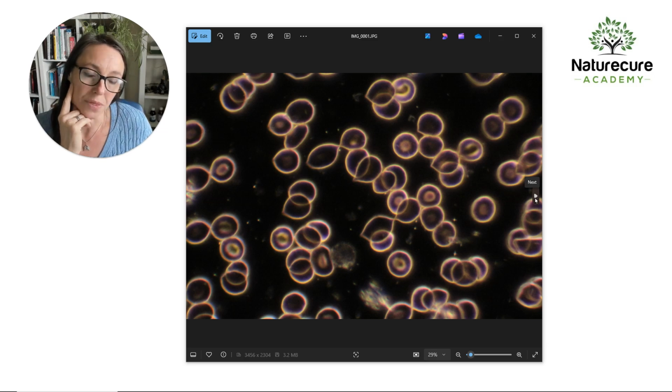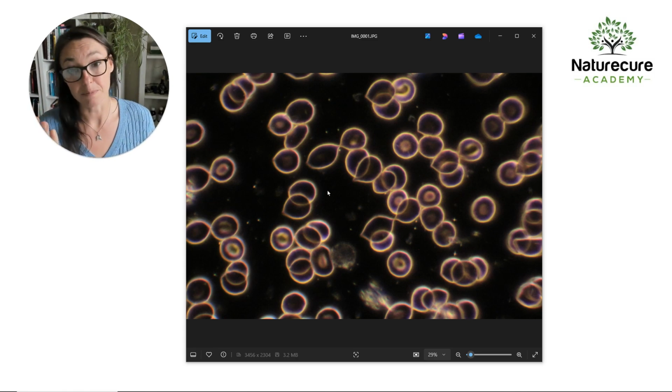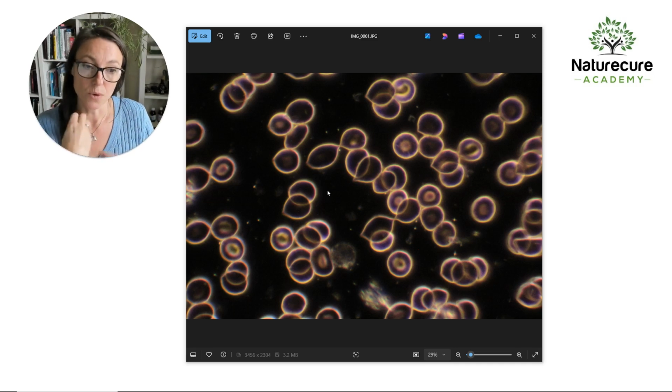And one thing I noticed when my client came and I saw her blood for the first time was that there were a lot of these white particles floating around in the plasma, and they were moving quite rapidly, and they are known to be called chylus, and this is what we call the food particles when they've been digested and have gone through the portal system into the liver, where the liver checks everything that's been eaten.